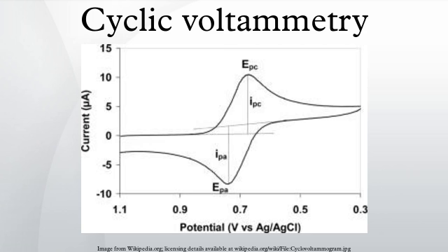As usual, the voltage in the cell was monitored using a working electrode and a reference electrode. Furthermore, a platinum counter electrode allows the current to continue to flow during the experiment. The carbon paste electrode sensor and a graphite epoxy composite electrode are tested in a saline solution before the scanning of the wines so that a reference signal can be obtained. The wines are then ready to be scanned, once with CPE and once with GEC.